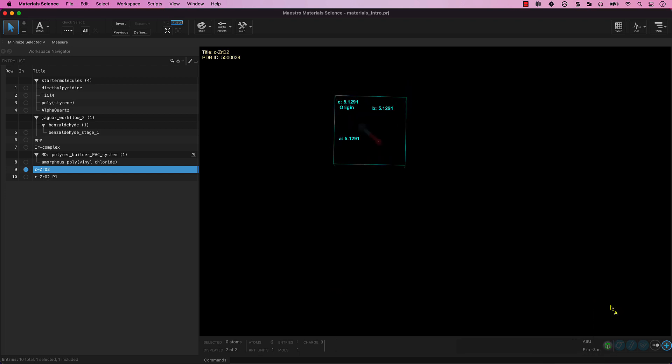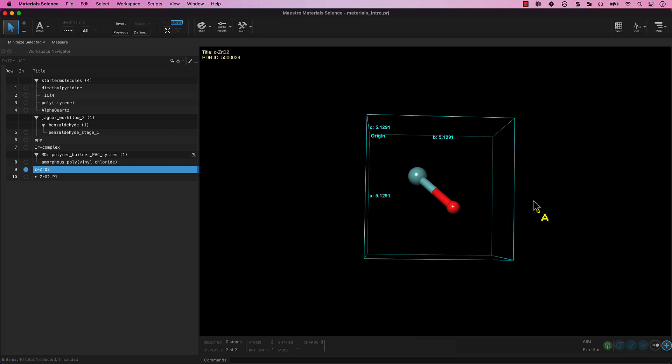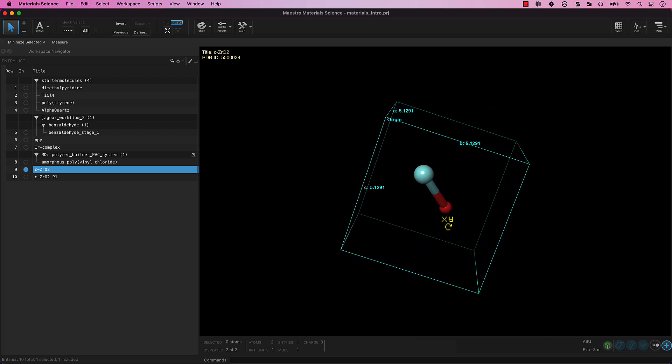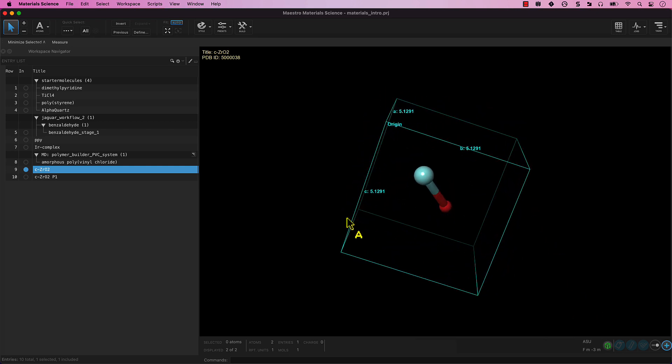We now have two distinct entries pertaining to the zirconium oxide structure, the original asymmetric unit, as well as the 3x3x3 supercell.